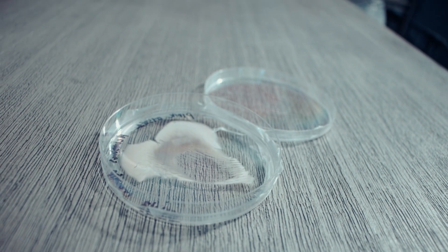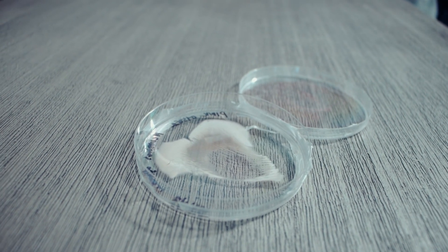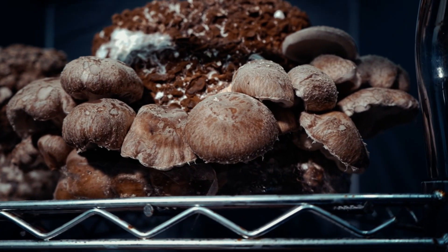The next consideration after the materials is going to be your genetics. Starting from a spore print is very valuable in liquid culture production because you'll be able to tailor your culture to your environment. If you have a bunch of mushroom genetics and you're trying to find the ideal mushroom to grow in your specific environment, you can select from a spore print the most viable strains. I would recommend streaking them onto a Petri dish and observing for the most rigorous growth, then isolating those genetics and growing them in your own grow tents just to make sure they'll fruit out at the temperature and conditions present on your farm.